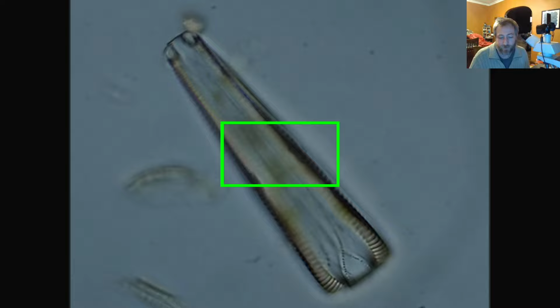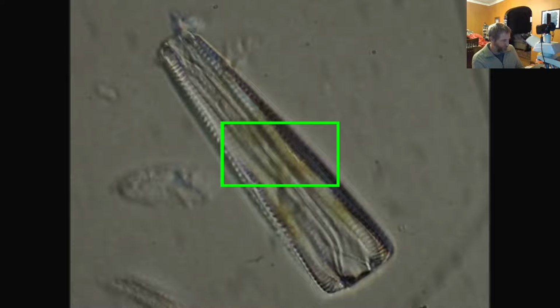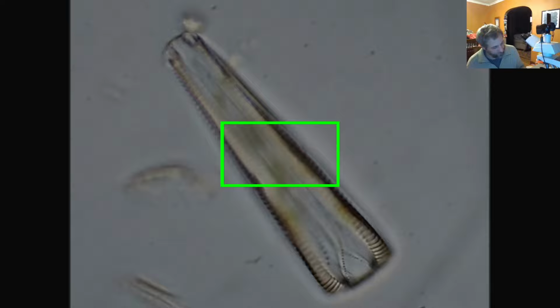Dark field is just a way of getting oblique lighting, usually by putting something between the light source and the objective. Bright field is what we call it, not light field. Bright field is basically where there's nothing between your camera lens, it's just an open hole. The light source at the bottom of your microscope comes up through nothing, hits your condenser, condenses it, hits the slide, goes through the sample, goes into the objective, and then to the eyepiece, or in my case, the camera and the eyepiece. So that's what's called bright field, the idea that there's basically nothing between them.